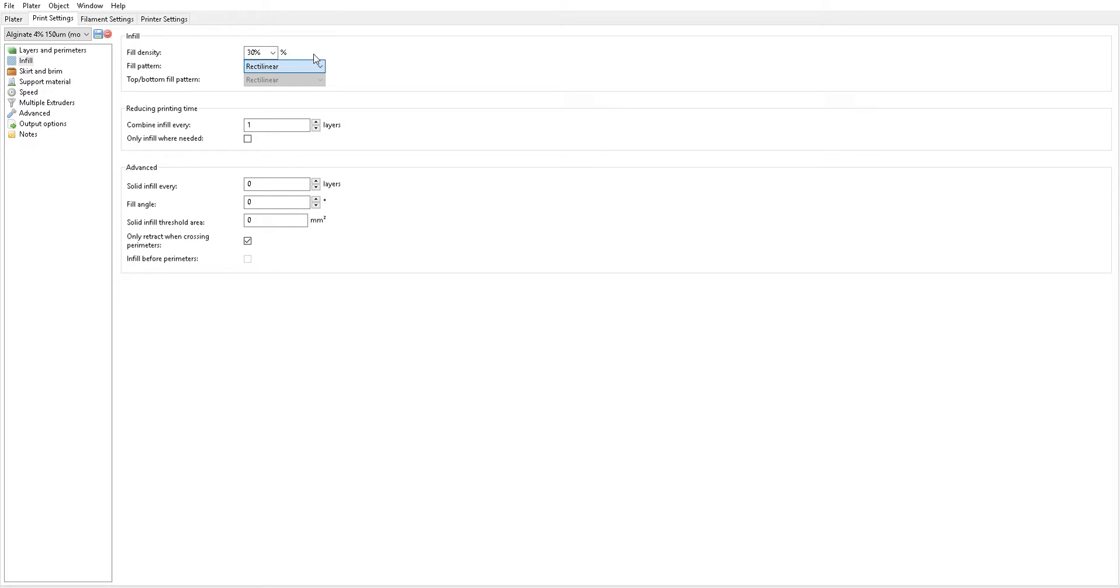Your infill pattern should be rectilinear. We've tried lots of different infill patterns and we find that rectilinear works best. We could probably make an entire separate video as to why rectilinear seems to be better than other ones like the honeycomb.